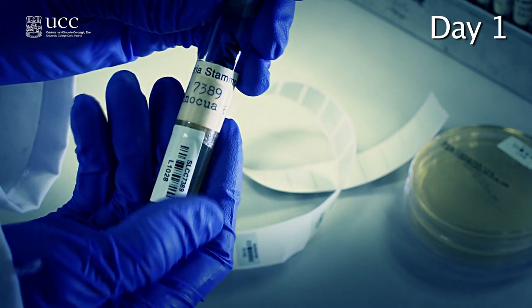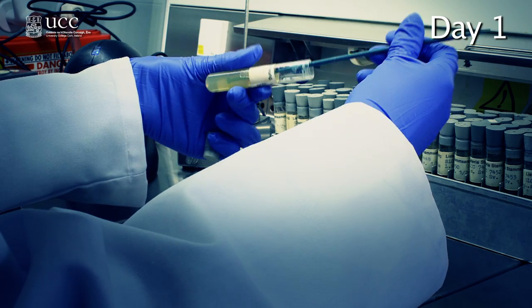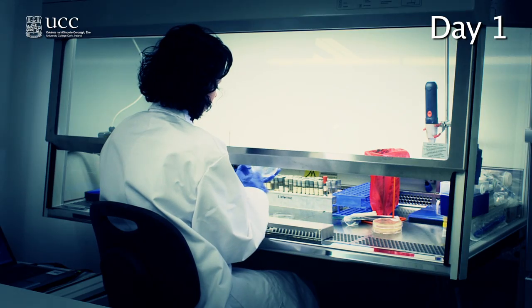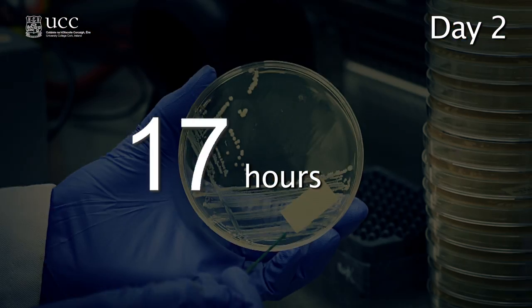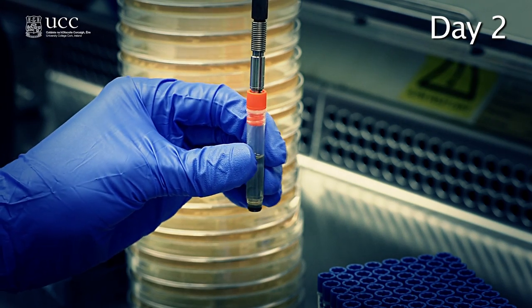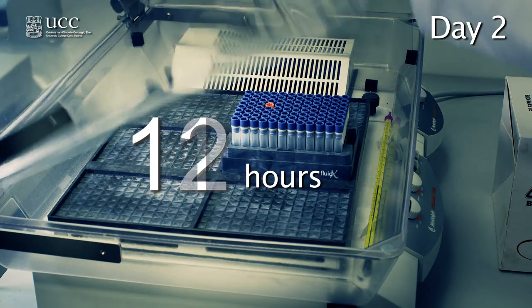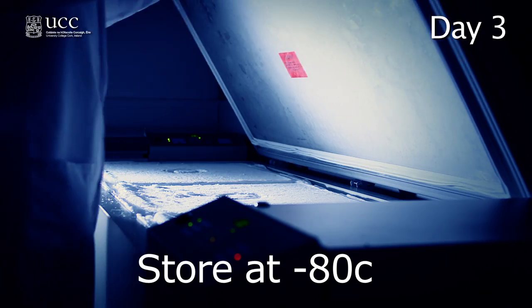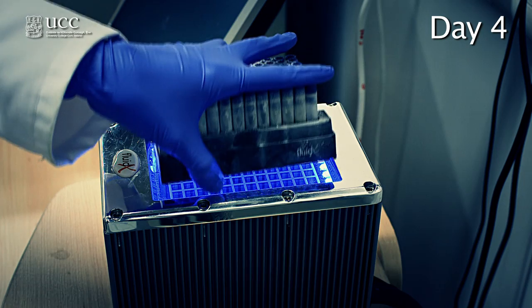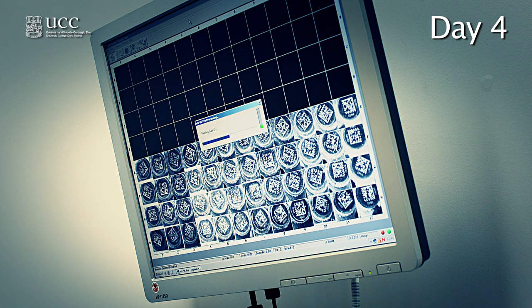Scientists here in Cork, Ireland have developed a robotic pipeline for bacterial genetics. Bacterial strains are barcoded, transferred to robot-friendly tubes, and tracked automatically through the pipeline. They have collected over 18,000 bacteria, and for their analysis, they also developed software which controls all interactions between databases, devices, and robots.